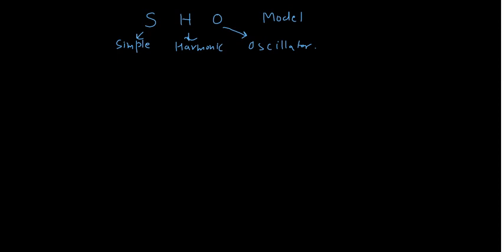All the simple harmonic oscillators follow Hooke's law. So I can write Hooke's law.